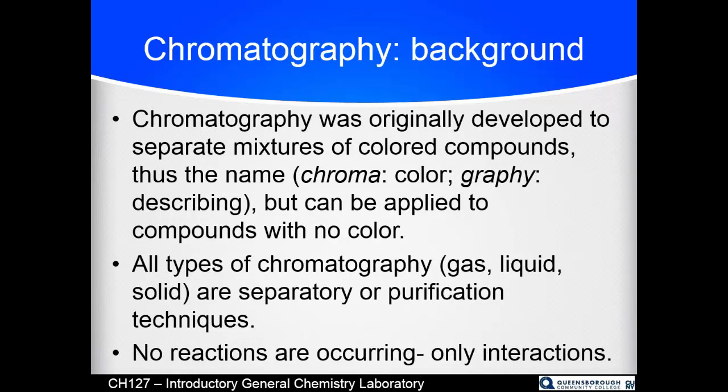Chromatography was originally designed with separation of colored mixtures in mind, but you can absolutely separate colorless mixtures using chromatography. For example, gas chromatography: most gases are colorless. The air that you're breathing is a mixture, and you can separate it with gas chromatography. We are going to separate the various colors that are making up a black ink pen, and we're also going to separate the components of a two-component mixture.